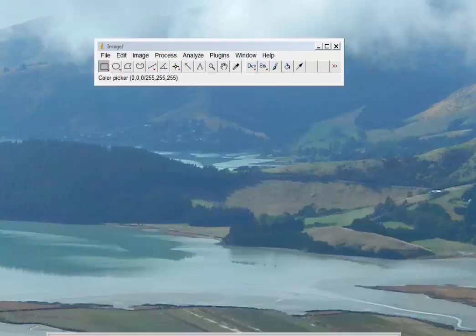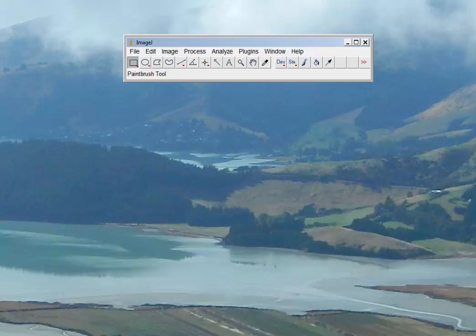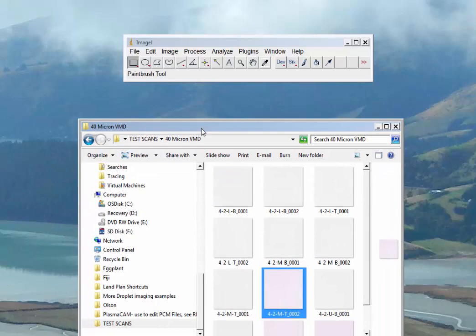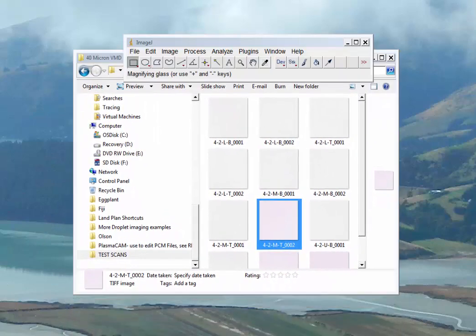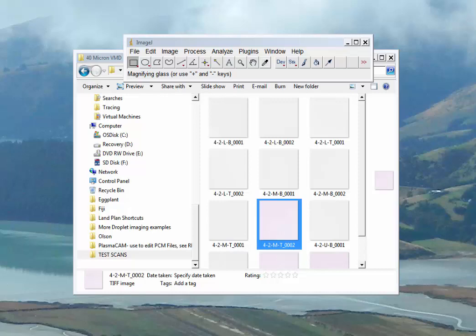Assuming that you've been through all that, we'll go ahead and get started. We've got our ImageJ window up here and we are going to pull up our test scans. Thresholding is the process of defining the colors that describe your deposition stains, mainly from the tracer you've added to your spray.